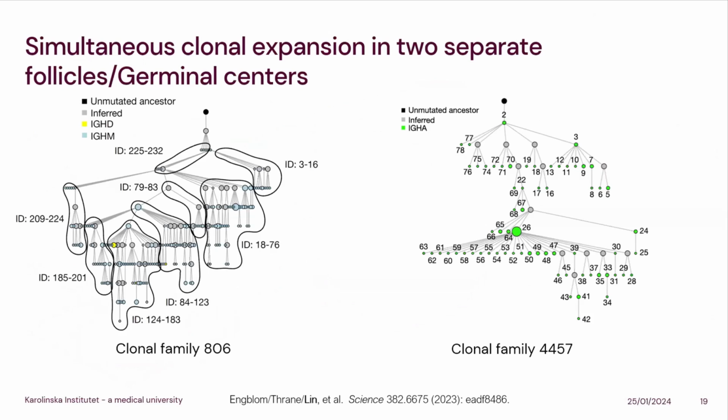So I'm not 100% sure what the best way is, but maybe we can base it on their gene expression, or let's say single cell data sets, and see how to link them together. From the spatial data itself it's hard to say because it's a mixture of cell types, but we can think more about it.